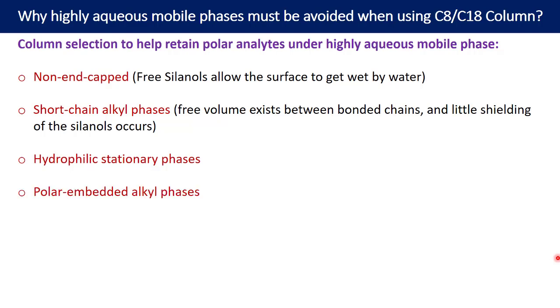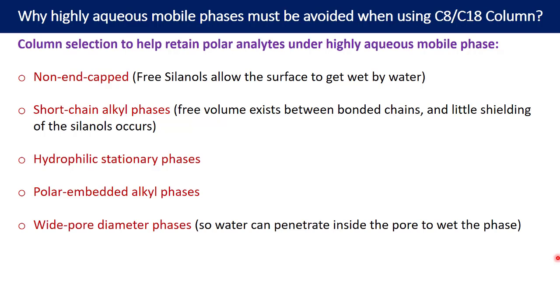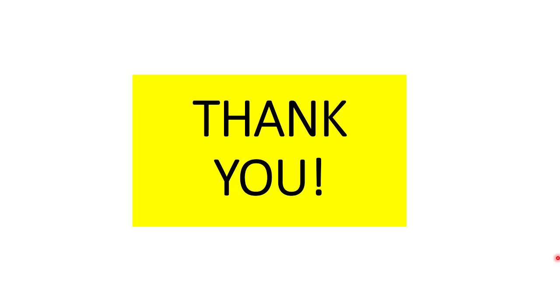You can also use polar embedded alkyl phases — examples include phenyl, pentafluorophenyl, and amine stationary phases. Last but not least, consider using wide pore diameter phases, because the larger the pore size, the higher the chance of water penetrating and wetting the pore. The smaller the pore, the lower the chance of water penetration. So always consider using columns with wide pore stationary phases. Thank you — I hope this helps you navigate the challenge of using highly aqueous mobile phases.